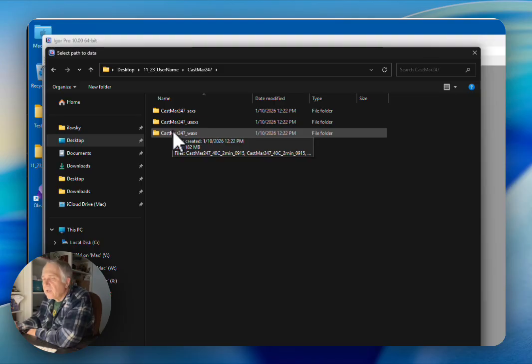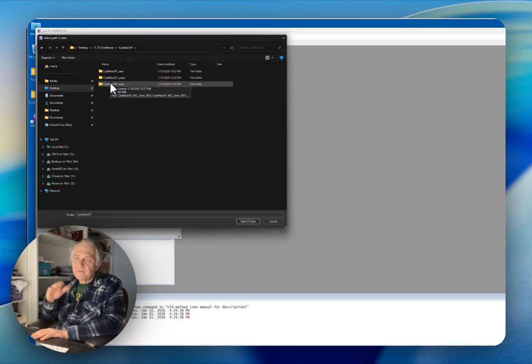In some way it matters only if you did not collect SAXS and WAXS for every USAXS. You want to point yourself to a folder where you have most of the measurements, and you're going to understand later why. Basically, in some cases we have users who want to collect, for example, during a heating cycle, at the beginning only the diffraction pattern, only the WAXS, because you can do it basically every second or every 2 seconds.